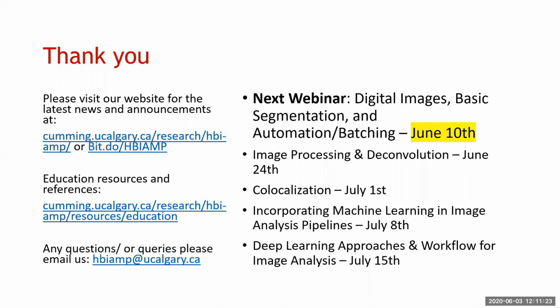I can see the next question. Is this the cover slip question? Yes. So not that I'm aware of. Cover slips are made of glass, and I am not aware of any glass that has a refractive index of 1.5 or less. I assume that maybe you want to do some live imaging, or I'm not sure what your sample is, but if the cover slip is getting in the way, get rid of the cover slip. Of course, if your sample is fixed and mounted correctly, a lot of people actually image without the cover slip, and you get some nice images that way.